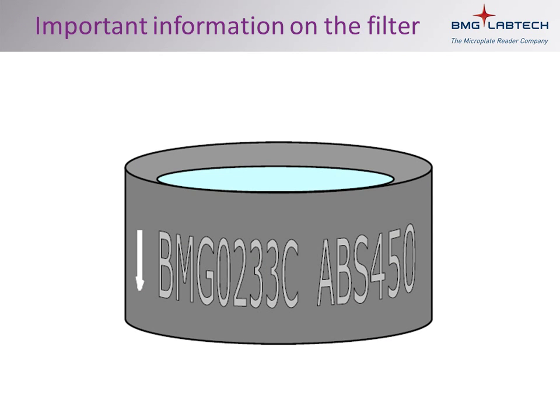If you look at the black ring that is around your filter, you will notice that the type of filter is indicated. In the cartoon example, it is a filter with a peak transmission wavelength of 450 nm. There is also an arrow on the filter. This needs to point out if the filter is in the excitation wheel, and in if the filter is in the emission wheel.